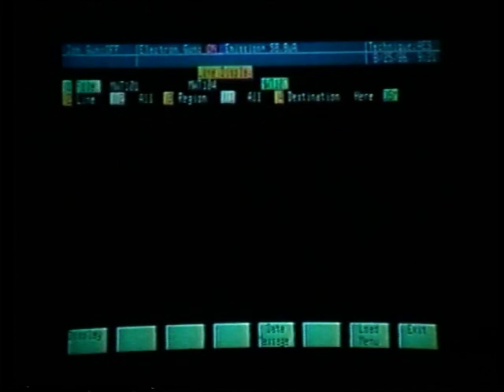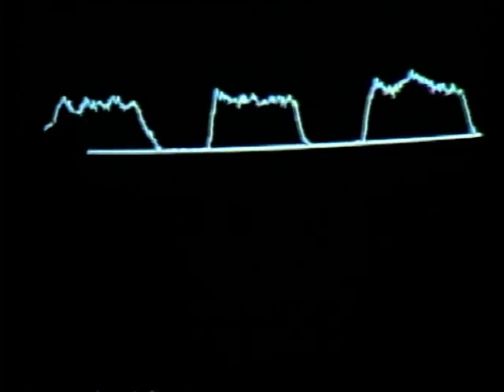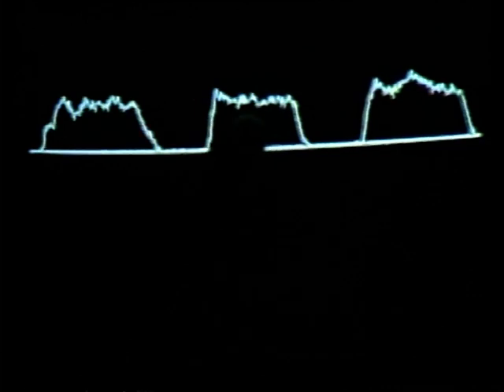Looking then at the TV monitor, which is now clear, we have no image, by pressing display, which is soft key number 1, I now have displayed the baseline where the line scan was acquired, and also line number 2, region number 1, which is the gold signal.